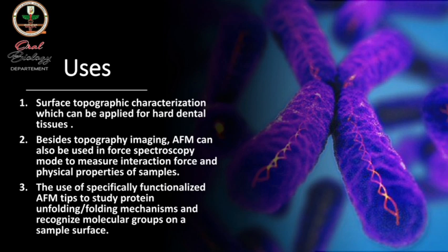Besides the topographic images, the atomic force microscope can also be used in force spectroscopy to measure the interaction forces and physical properties of the sample as well, which is considered a great advantage recently. Recently, it's also used with specifically functionalized tips to study protein unfolding and folding mechanisms and recognize molecular groups on a sample surface.